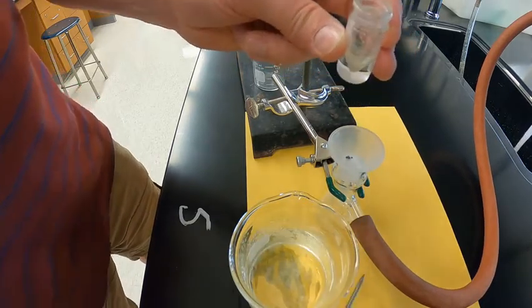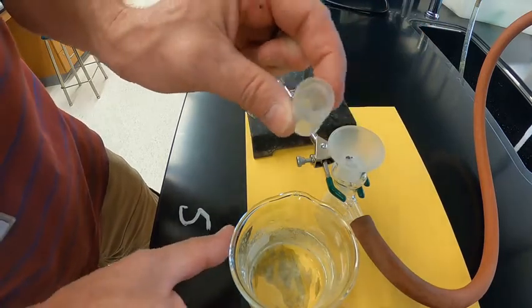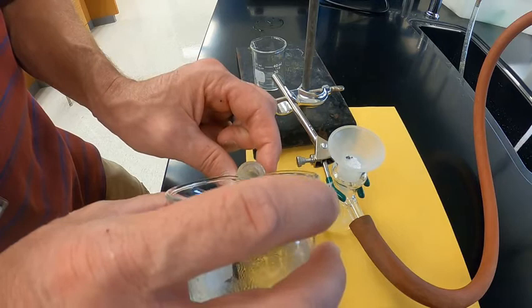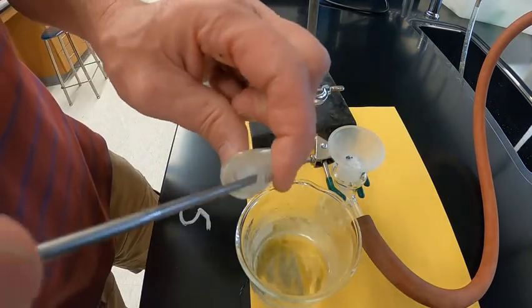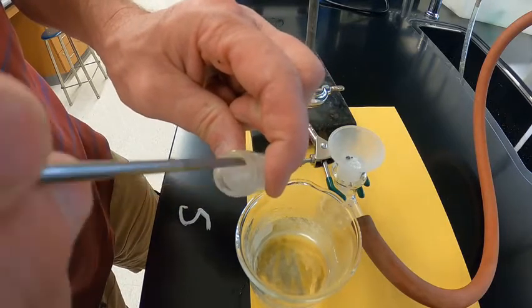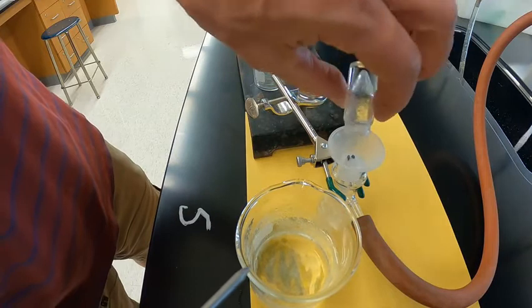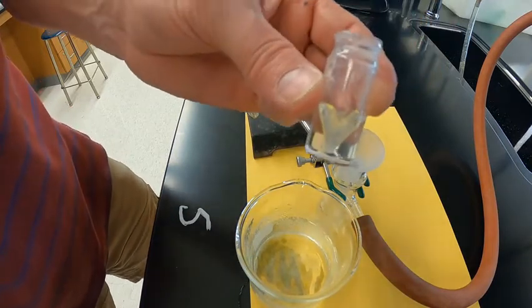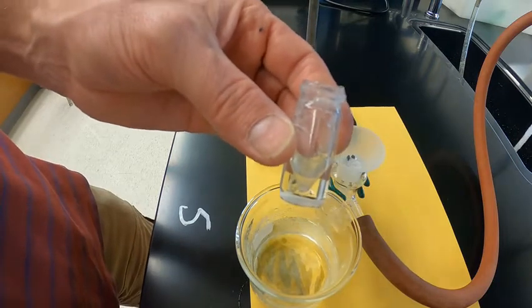So that's one thing when you write about your discussion of results. If the percent yield isn't very good, or it's a little low, maybe it's not 100%, hopefully it's not more than 100%, you did something wrong. But if you don't get every last little bit out, that's part of what our problem is, that some of the product was still stuck in the vial.